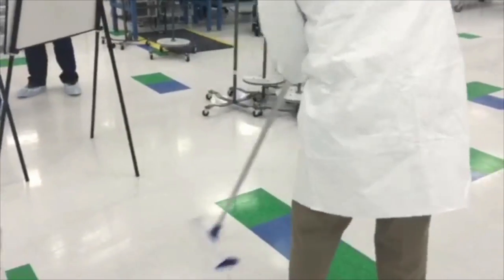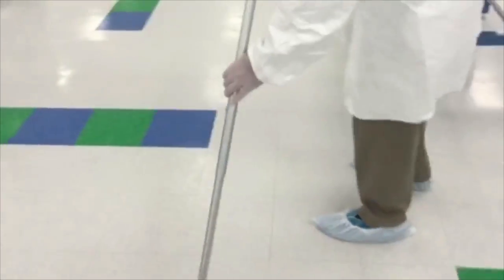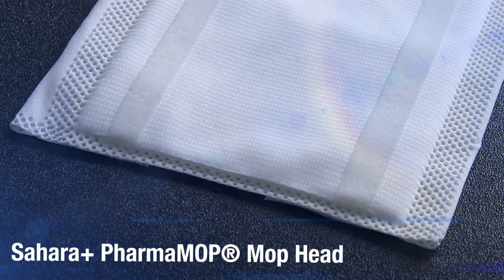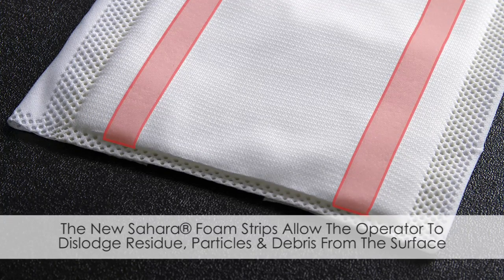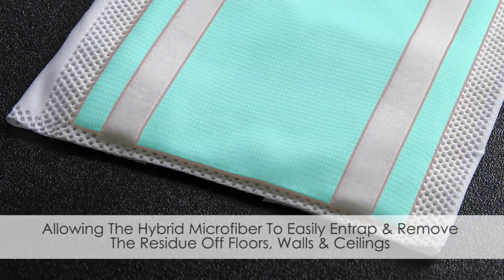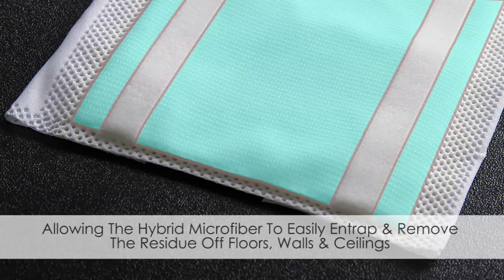It is well understood that medical devices be kept free of contamination in order to avoid costly rework, inspection, and re-cleaning. The clean room grade Sahara Plus PharmaMOP is constructed with the Sahara foam, which dislodges and entraps large fibers and particles, and a hybrid microfiber which entraps and removes soils, bioburdens, and small particles, allowing facilities to upgrade their cleaning practices.